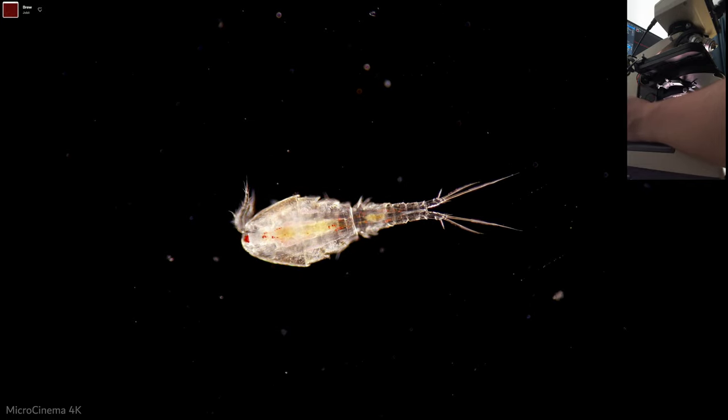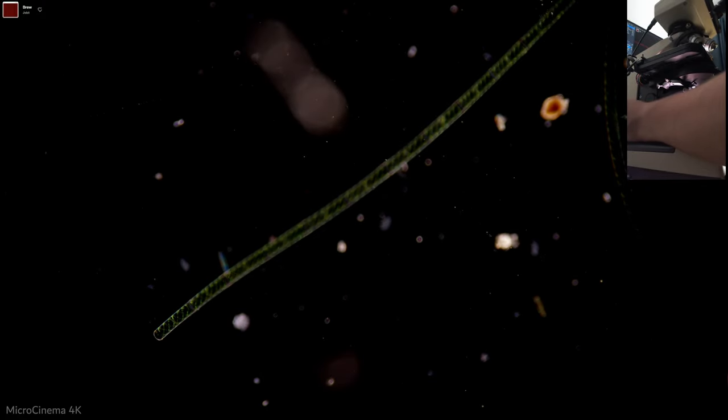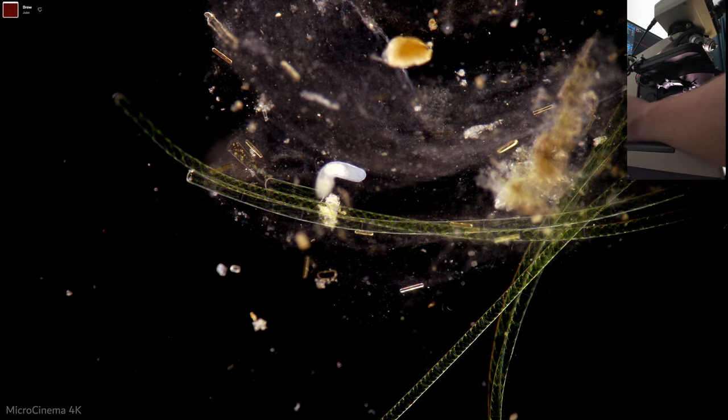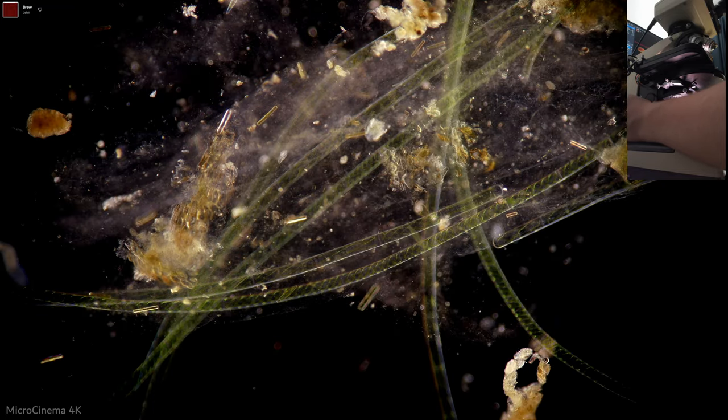I think we can go one. I think right here is just about perfect. Perfect and yeah, this is fantastic to be able to switch into dark field so easily.